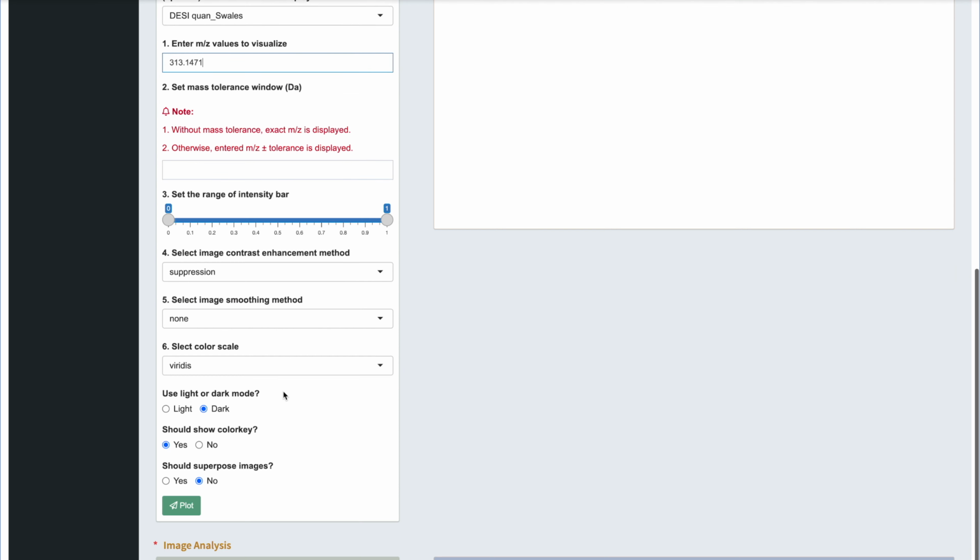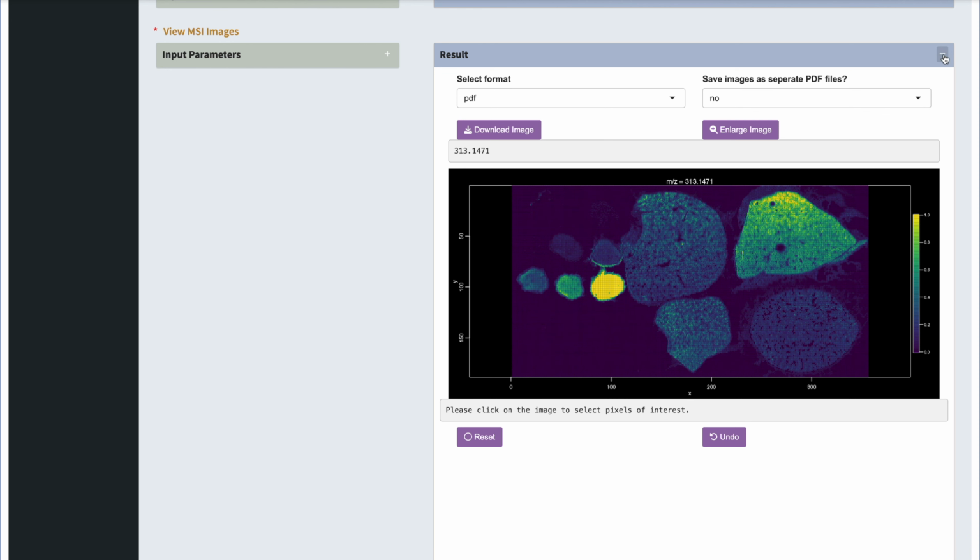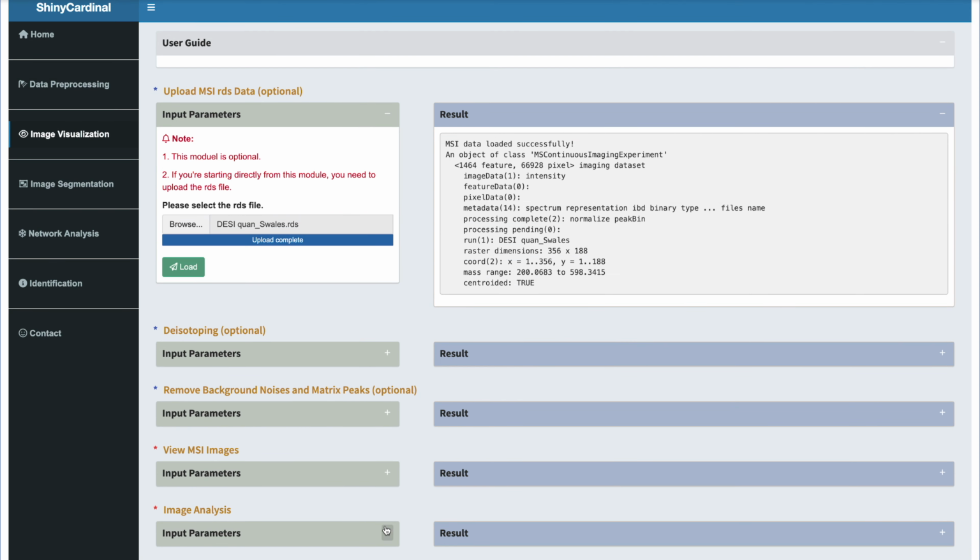You can see that olanzapine at 5 different concentration levels are detected, and there are also 4 samples next to the olanzapine internal standard spots. The generated ion image is automatically transferred to the image analysis module, and from there, we can perform quantification analysis. Next, we can draw regions of interest to select the olanzapine spots.